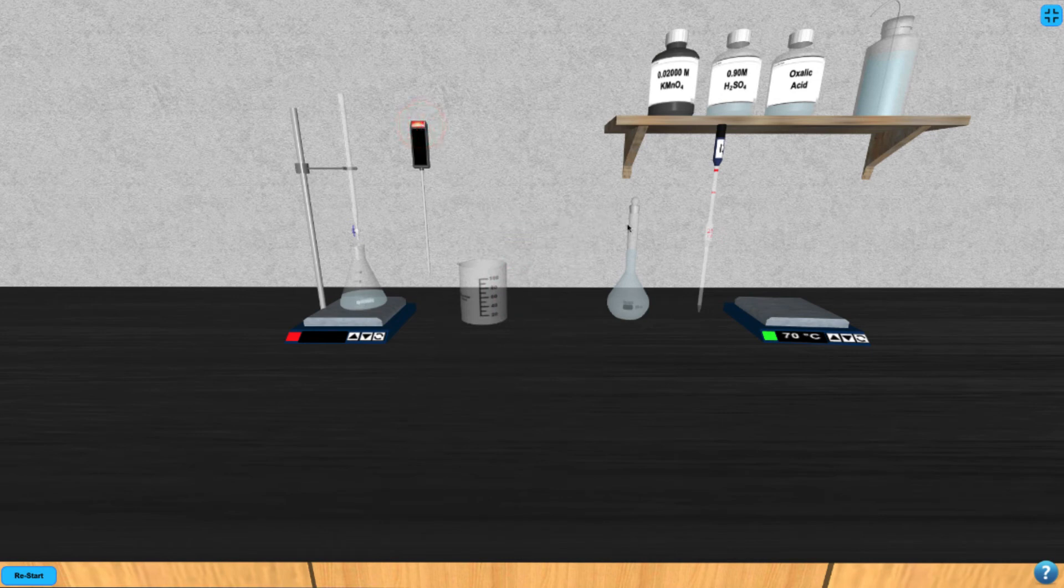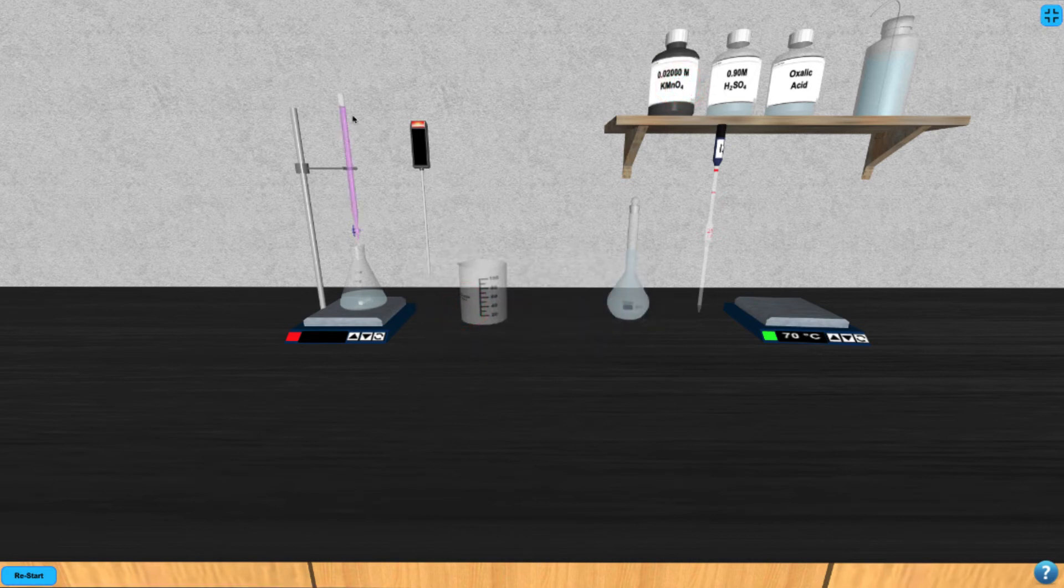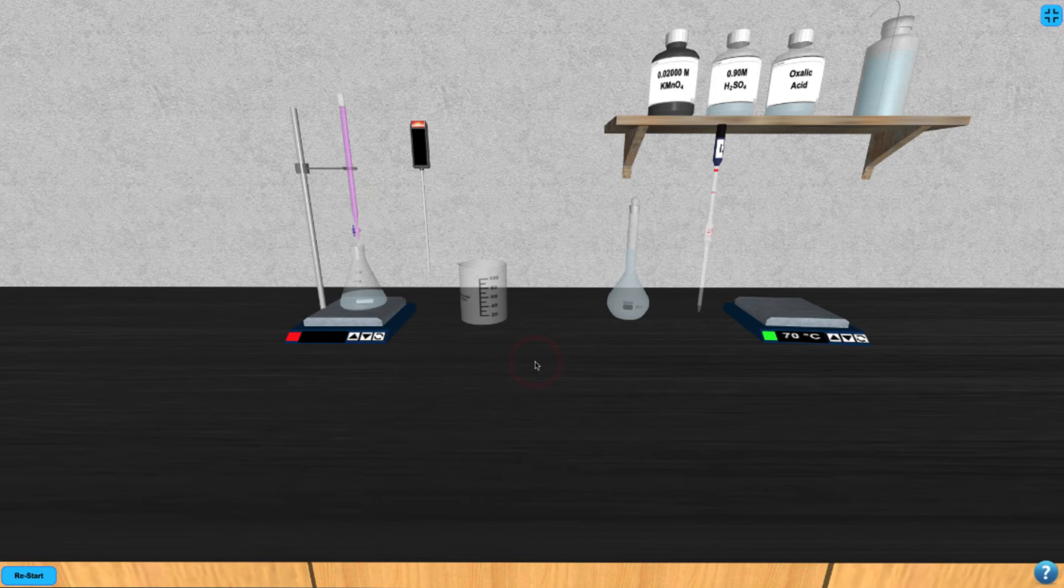Click on the potassium permanganate to fill the buret. Be sure to note the starting volume in the pipette by clicking on it to zoom in. Now you can use the down arrow to add potassium permanganate drop-wise from the buret. Start by adding just three drops.